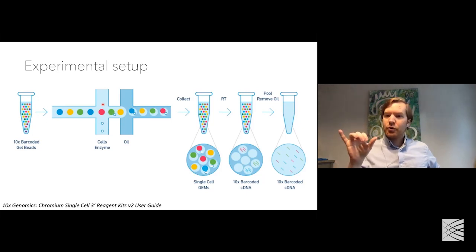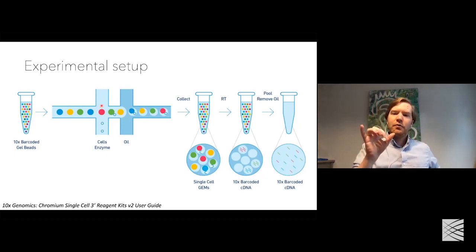Exactly how that's prepared, I don't know. That is part of 10X's process to produce these gel beads. Probably one of the most important parts of the experimental procedure. And those two elements, the droplet barcode and the UMI, are followed by a poly-T stretch. That stretch of poly-T is then used as sort of a bait to allow polyadenylated mRNAs to hybridize.